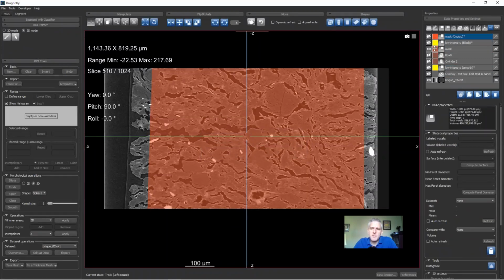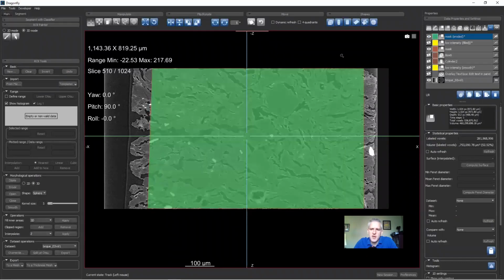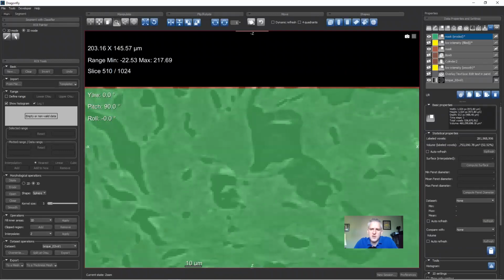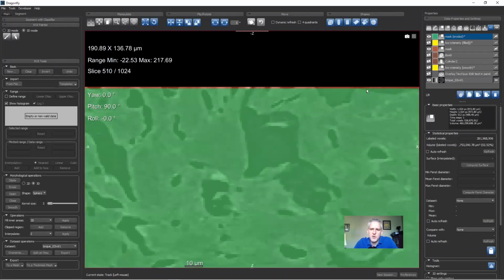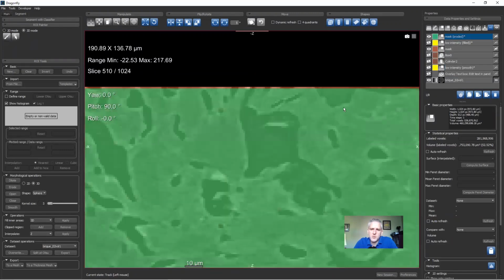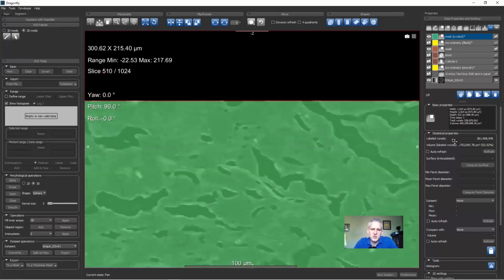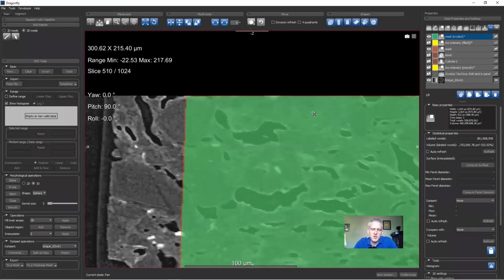Okay, so I've got mask and I've got mask copied, but I'm going to rename this mask eroded. So I take mask eroded and let's make it, I don't know, green. And okay, and we'll turn on the visibility. And if I zoom in, you'll see the difference between mask and mask eroded. Mask goes everywhere. Mask eroded only goes up to the very final pixel on each face. So using a left, right to drag and a middle to zoom.